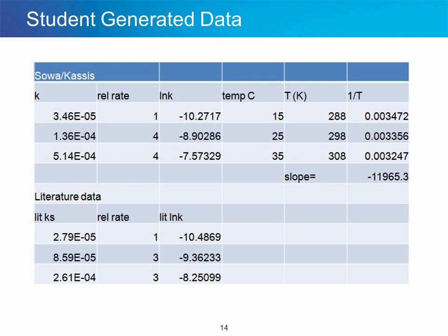One of the things that we observe for this reaction is that in our system we stir the reaction at about 500 RPM. There is a significant mixing time for the tertiary butyl chloride, so the original reference actually stirs the reaction by just swirling it by hand. So maybe the difference is a difference in mass transfer. Nevertheless, the kinetic data are within reasonable agreement.